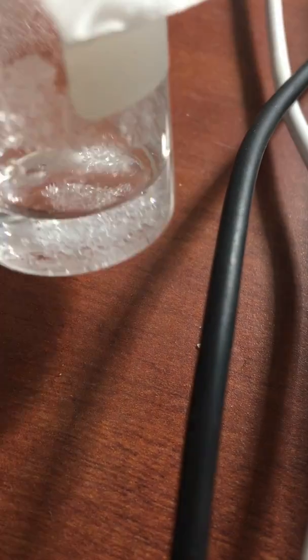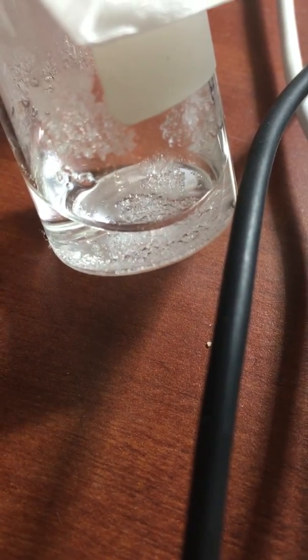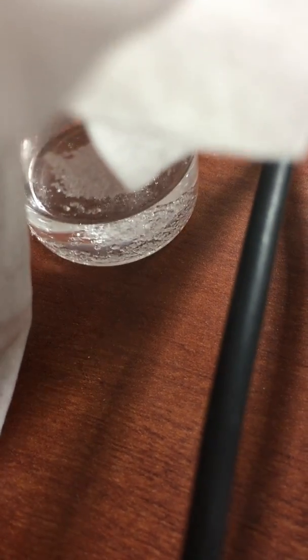So, what might be affecting the crystal growth is the room temperature and the air flows. Because as the temperature increases, the rate of evaporation increases. And then the air flows: if the air flows faster, then its exchange with the air is faster, so there are more water molecules able to be brought into the air.